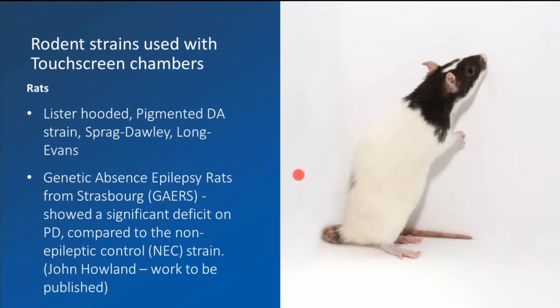Here is a list of the rat strains that have been reported in the literature as being used with the touchscreen chambers. There are probably more strains that have been used, and we're currently asking customers to let us know which rodent strains they have used and how they perform. So if you're listening today and can help us with that, we'd love to hear from you.